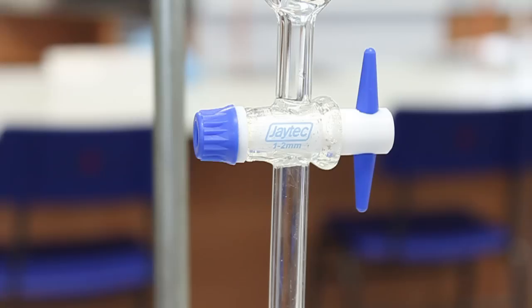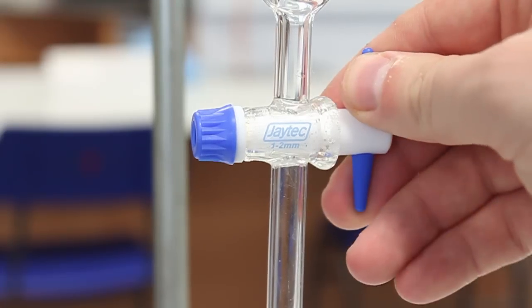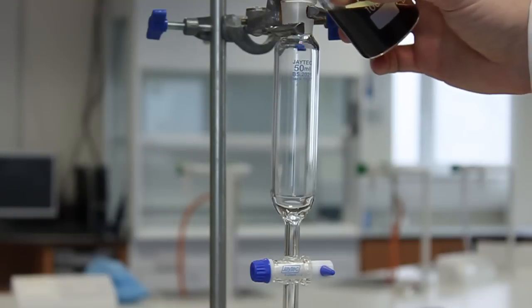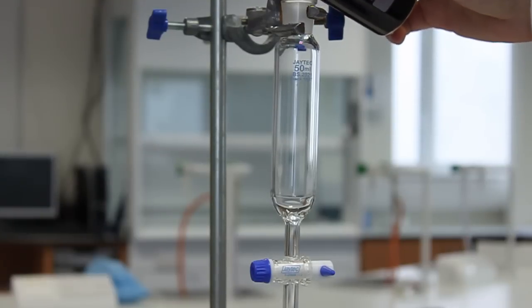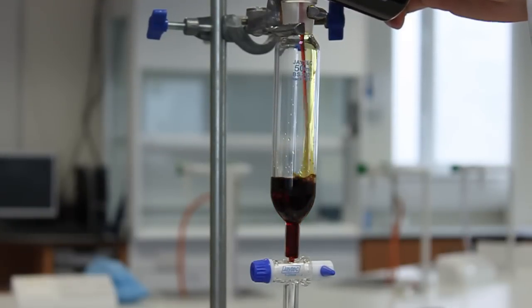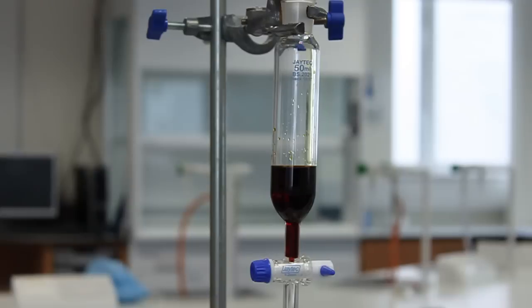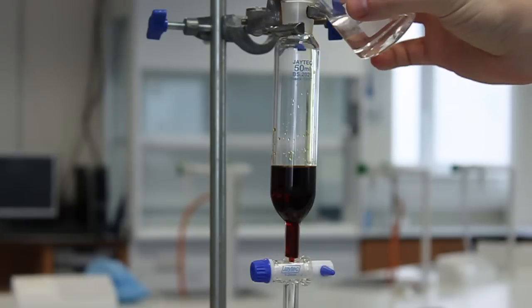Start by mounting the separating funnel in a retort stand. Ensure the tap is closed and then add the reagents. Here we have an aqueous solution followed by an organic solvent.